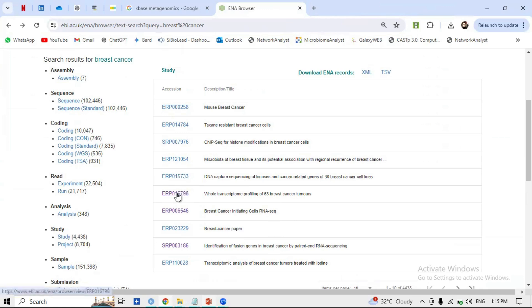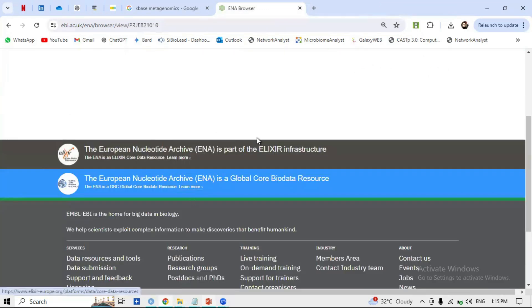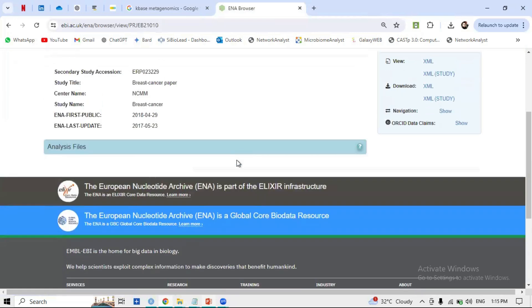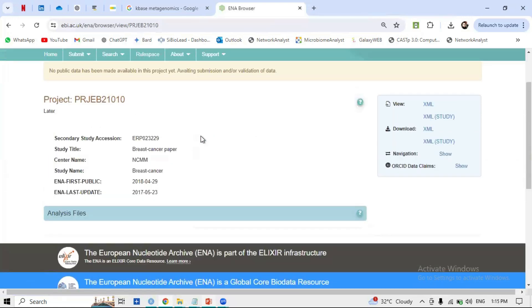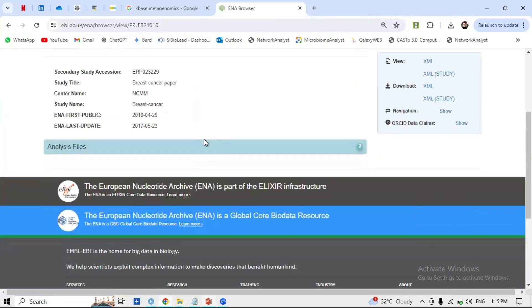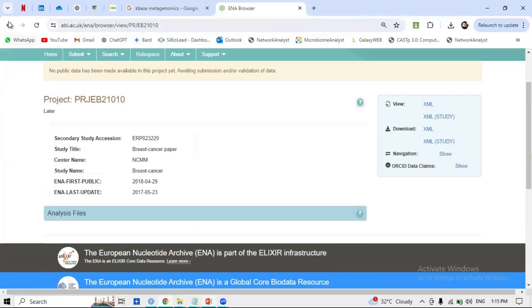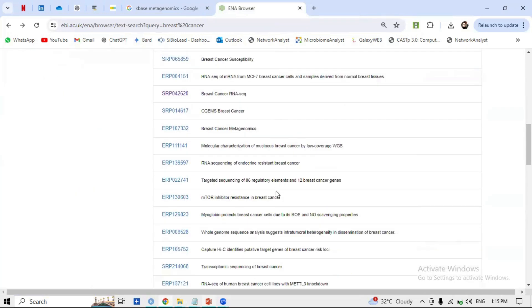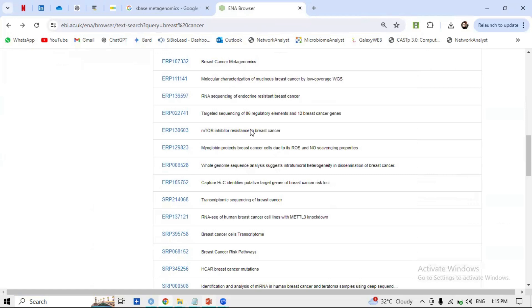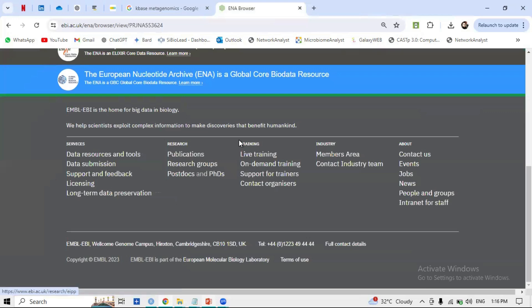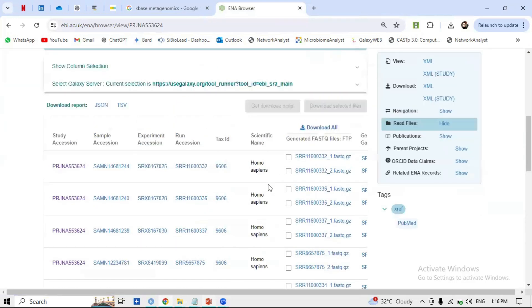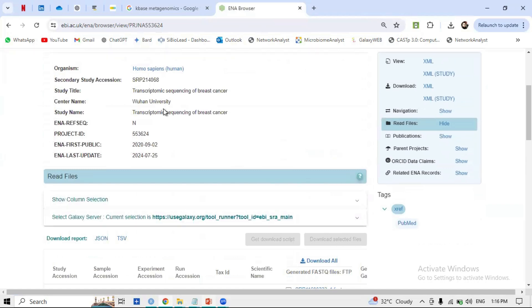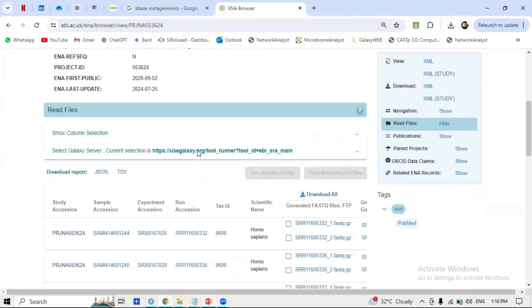Clicking on a study to check what type of research was conducted — but sometimes no files are uploaded by the researcher, so go back and try another. Another example: a study on drug-resistant breast cancer or transcriptomic sequencing of breast cancer from Wuhan University. Clicking on it shows the files are transcriptomic and paired-end.